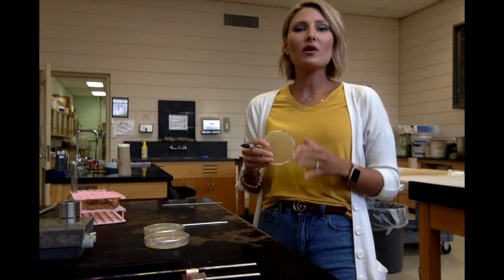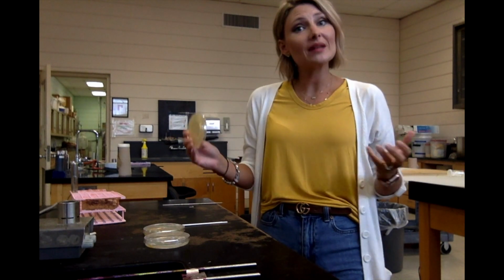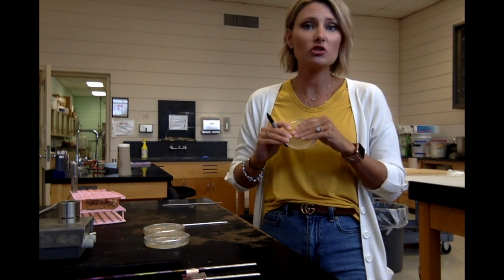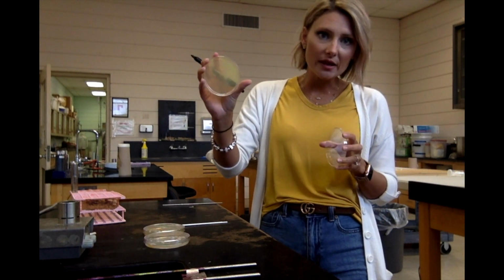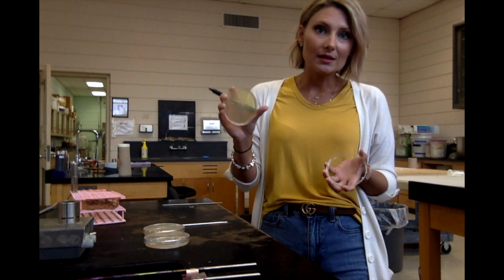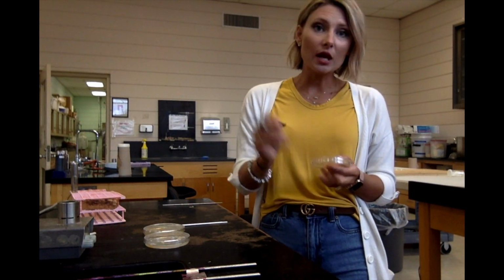Now, you always want to label the bottom of your Petri dish because that's where the bacteria is. That's where they're growing. They're growing on the media, and the media is in the bottom of the Petri dish. So if you somehow get the top and bottom separated, you still know what's in this plate. If you only label the top and they get separated, you have no idea what is in this plate, because a lot of times you're going to have a whole stack of plates. So we always want to label the bottom.